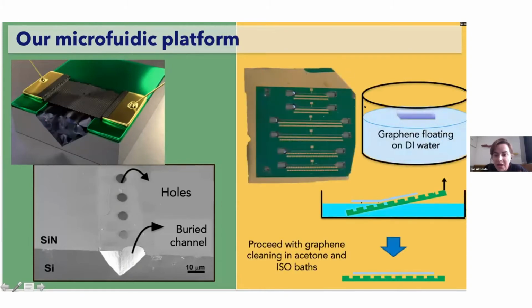Here is a real photograph of our platform. It has 1 inch side and 6 microfluidic channels on it. On the opposite sides of each channel, we have 2 big holes that are the inlet and the outlet for liquid insertion.